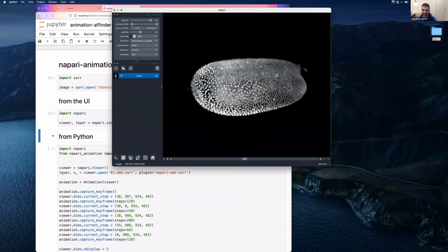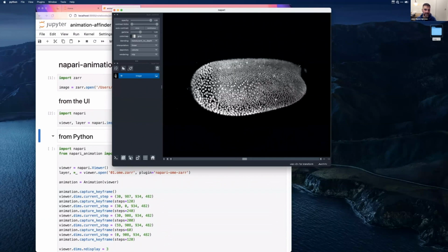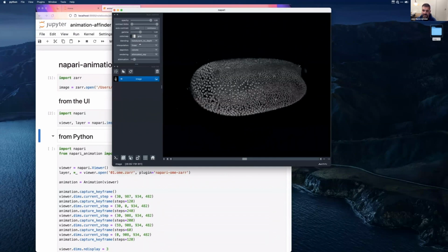Whoa. Okay. So let me just set a couple of settings in terms of the rendering to make it look like how I want. So I'll do that, attenuated and a little bit brighter, like that. Okay.